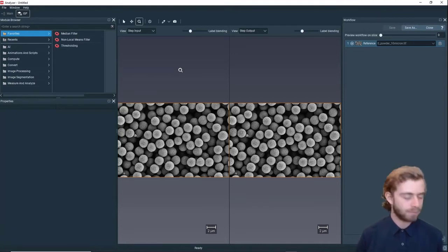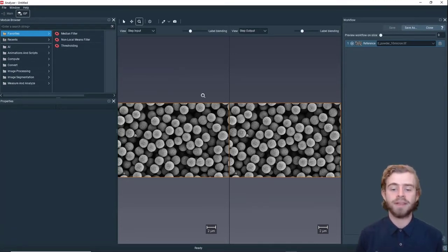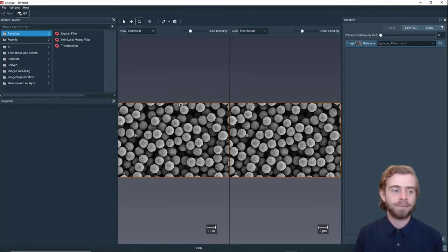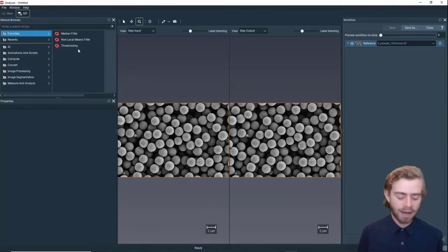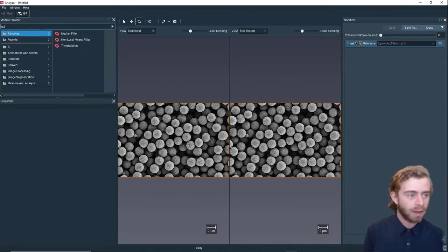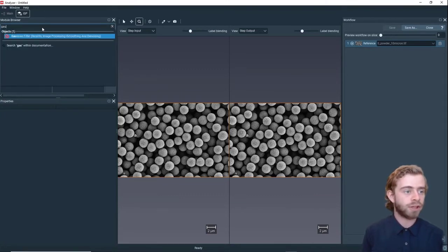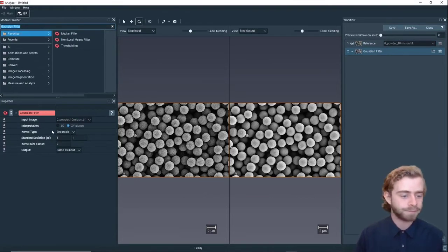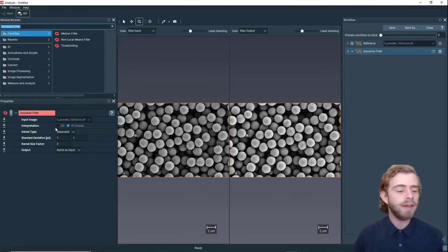The goal of this video is we want to segment out each of these powder balls separately. To start out, let's create a Gaussian image filter. We're going to go to the search string and search for Gaussian Filter and click Enter.